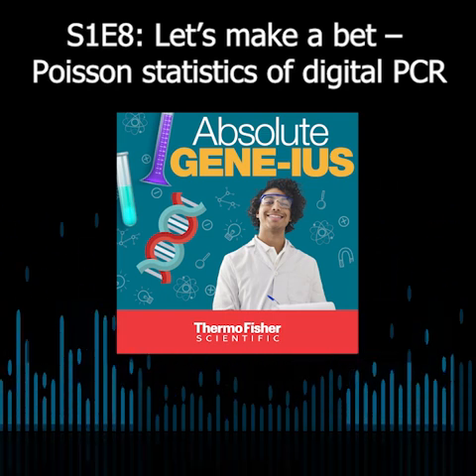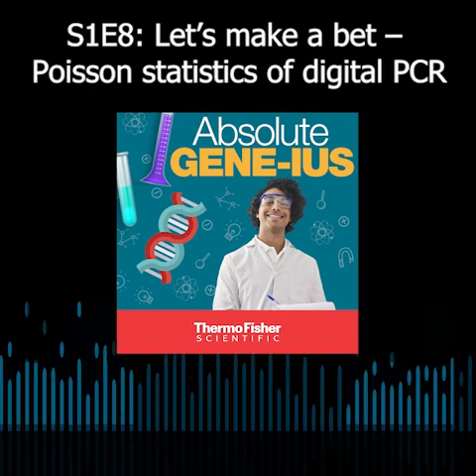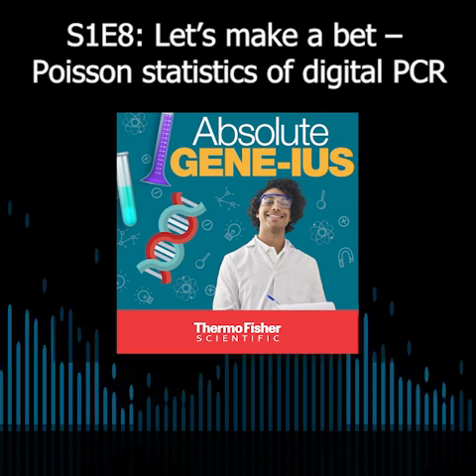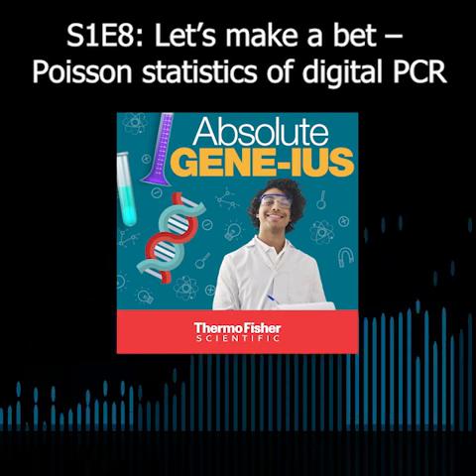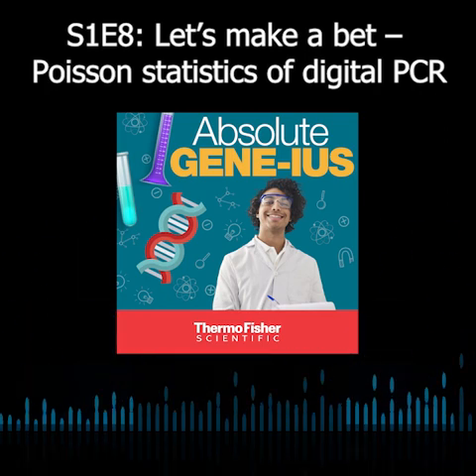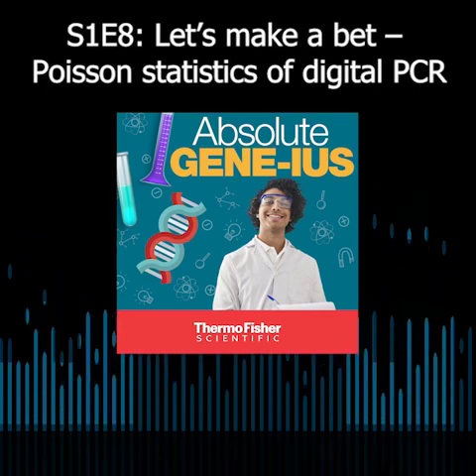That makes sense. I mean, if you're talking 20,000 reactions, these micro reactions or so, and you have 40,000 targets, you're not going to get any zeros. So your range that you can measure would be skewed. Is that a correct assumption or a correct statement?